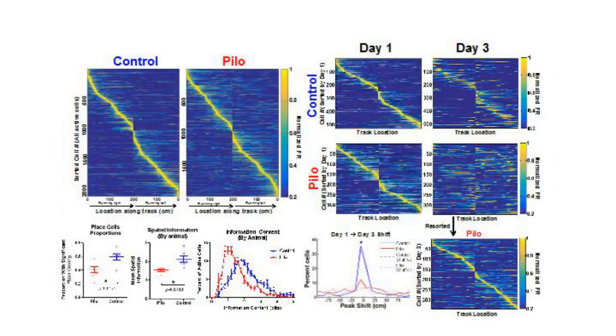And we have some quantification which shows that about 40% of cells retain their place fields in the control, whereas very few cells are retained in the epileptic animals shown in red. So we were excited by this, and this is a great functional biomarker for us to test various treatments that we hope to test in the future to see whether we can improve these place cell representations and make them more stable. And we're in the midst of doing that.